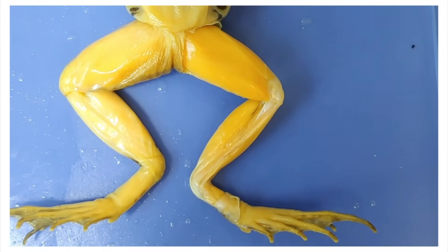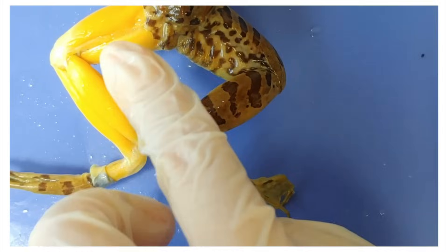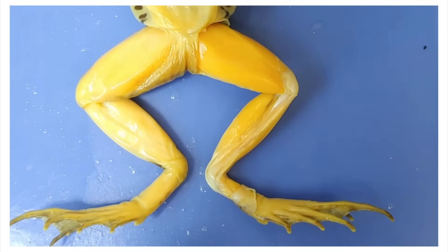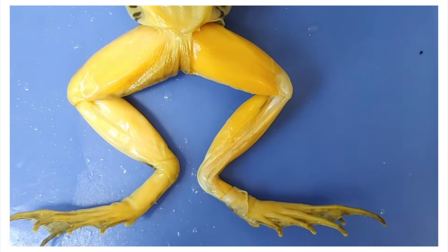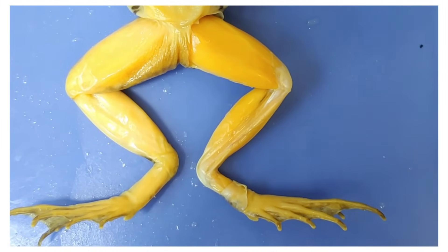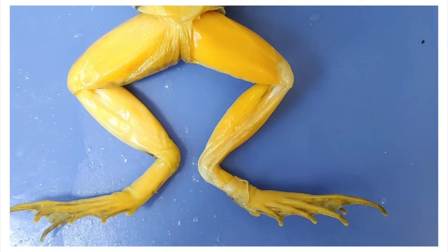You can now see the leg muscles, and holy hell, they're big. Frog legs actually take up a quarter of its mass, and for good reason — frogs do not skip leg day. These muscles are what allow frogs to jump over 20 times their body length. That's like a human jumping 30 meters, or the height of a three-story building.